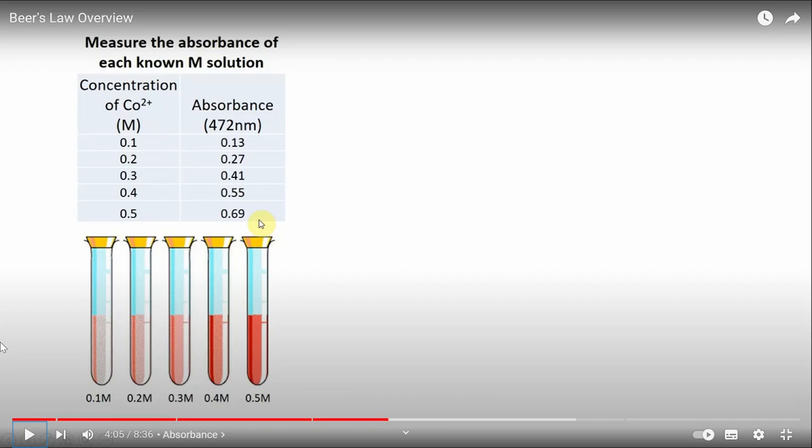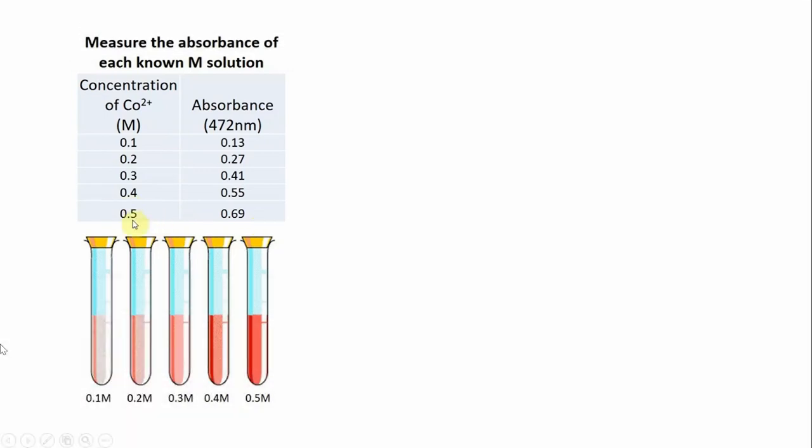With any concentration, it will be the highest peak. Do you remember how we had the one that was a little taller and the one that was shorter? Where the highest part of the peak is doesn't depend on the concentration. So we choose that one. Yeah, perfect. As I get more stuff in there, more of that light is absorbed.